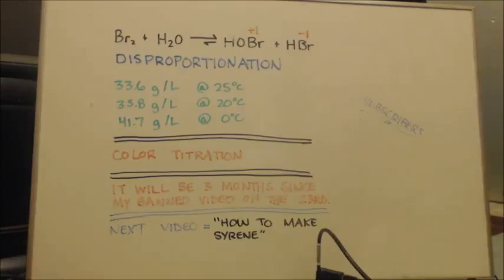Now, if you saw my bromine video, you've seen that there was clumps of, I don't know if it's polymerized bromine, or maybe it's a combination of bromine and chlorine that polymerized, made some oligomers or trimers, dimers, whatever. I don't know what it was. I didn't get it out. I just dumped it all into the water, as you'll see. I know there was 40 milliliters of bromine there, but there was a little bit of water in there. Not enough to form two layers, but still there was some water in there, and there was the solids.